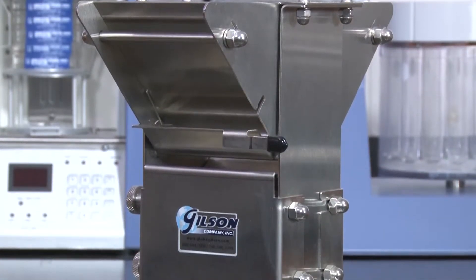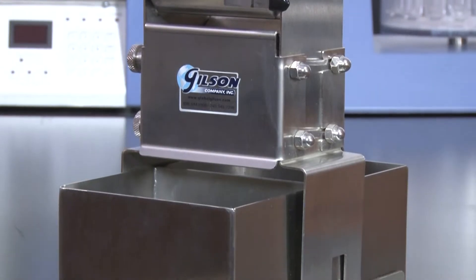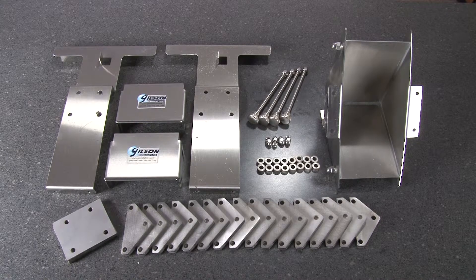The Gilson Precision Splitter side panels ensure that no sample is lost during the dividing process, and will quickly and easily disassemble for cleaning.